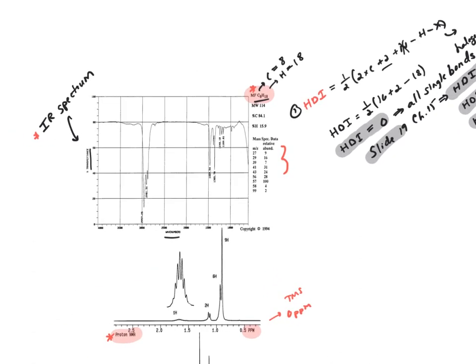The big thing that we're going to take away from the IR spectrum for each compound is whether or not there is a functional group present. That's really the only thing it's going to tell you, and I'm really trying to stress that. As a reminder, if you go through the lecture, there are 2 components to the IR spectrum. There is what we call the fingerprint region down here, and then there's the diagnostic region, which goes from about 1500 all the way up to 4000 wavenumbers. If you assign stuff to the fingerprint region, when I've told you that you can't really do much with it, I'm just going to count it wrong.